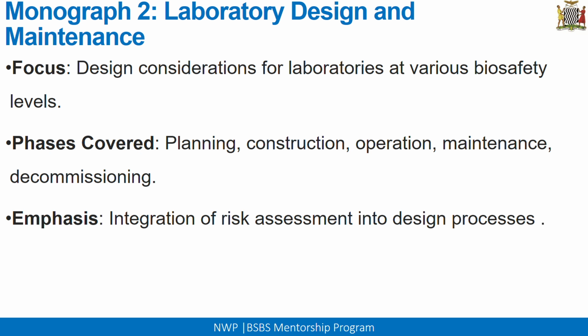So what are the risks associated with actually putting up that structure where you're supposed to put it? What are the implications on the people that will be working in that particular lab? And what are the implications on the environment around the laboratory, as well as the communities at large? So you look at the risks that are associated with all the key players: the people working, the environment, as well as the community.